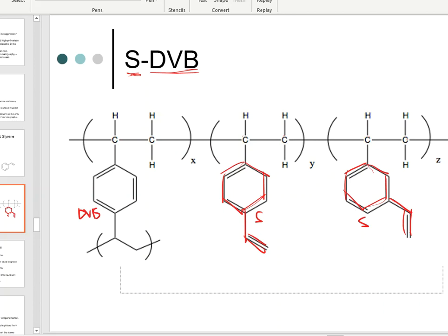And you're probably wondering, well, wait a minute. You told me that there were going to be two of those, right? Or one of those. What's going on here? Well, what they're showing you here is that there's a benzene in place. And this benzene has a group that's hanging off of it. And this group is going to be a continuation of the other chain. So this is actually a linkage here.